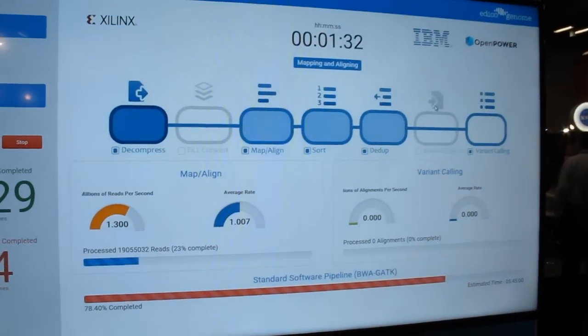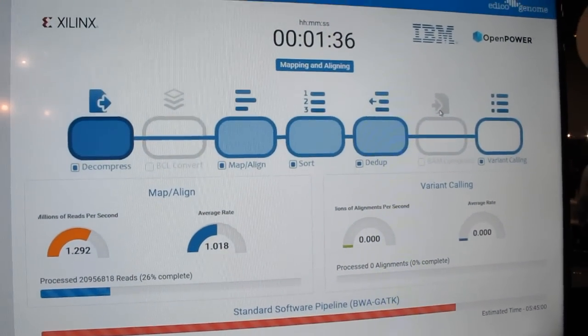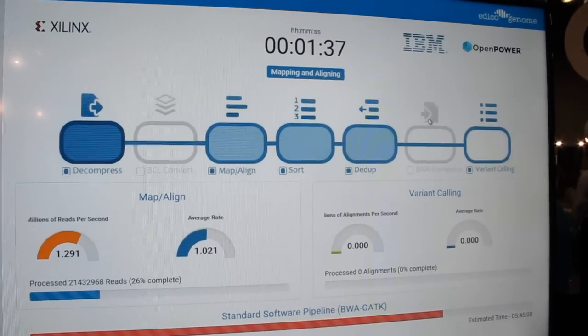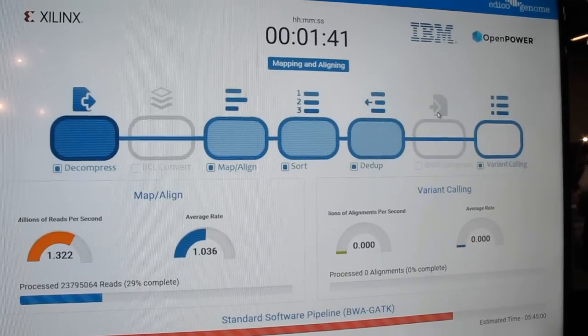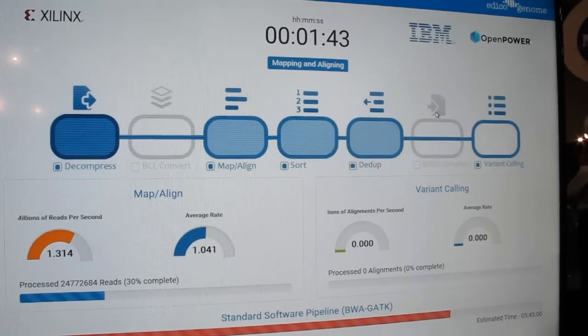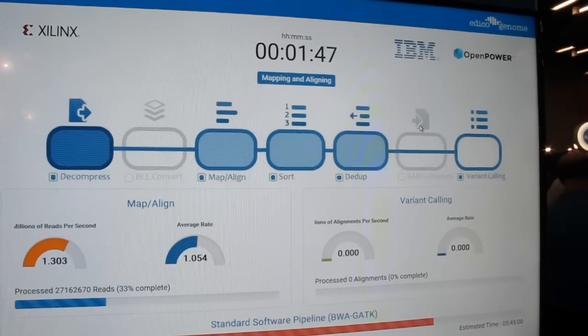It's in a Xilinx Power 8 server. We're running a whole exome here. Instead of doing a genome, which takes around 28 minutes for us to process, we're processing an exome, which is just the protein coding sections of the genome. It takes about six minutes, so it's a more manageable size demonstration.